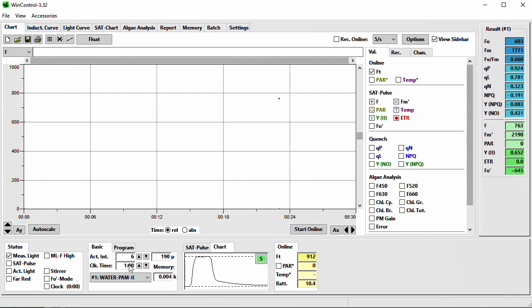In the Status field you can see which instrument component is currently in operation. When the checkbox is activated, the labeled item is executed. You can use this field also for manual control — for example, activating the Actinic Light checkbox will switch on the Actinic Illumination.